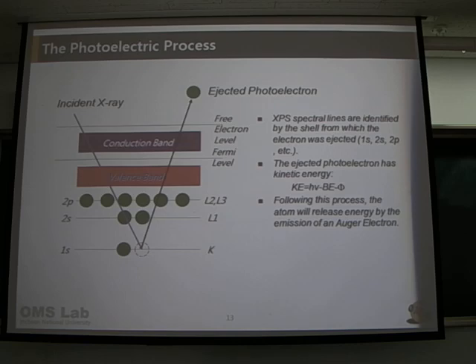This energy is called the work function. Not to the surface, but from the Fermi level. Every atom has a different ionization energy, the energy needed to take the electron out. Of course it's a constant, but if you change the atom, then it will vary. It is atom to atom. This one can vary, and this is known. So I'm asking, what is the work function?